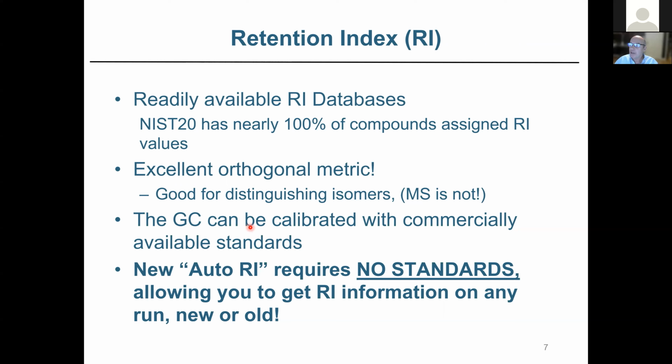You typically do have to use an additional run to run this calibration for retention index. Sometimes it's not convenient. Sometimes people find it a little difficult. And this is some of the feedback that we've gotten from our users.